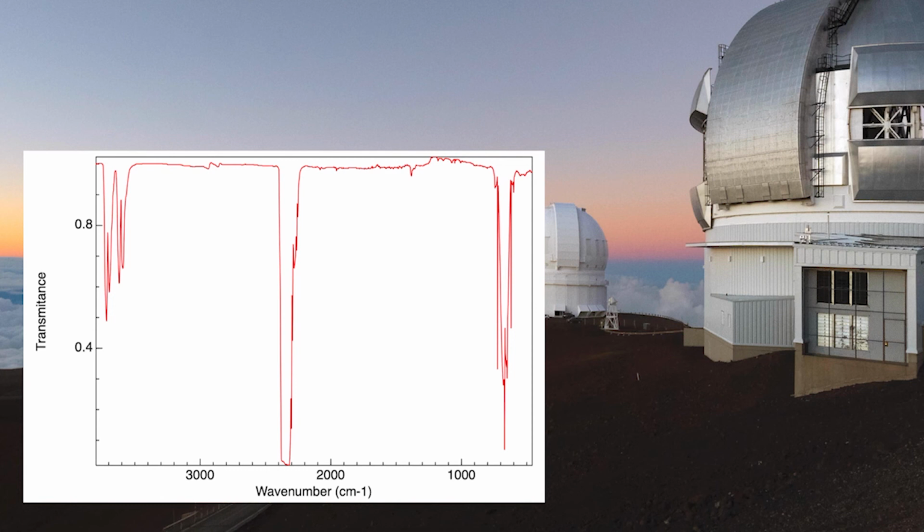And we can see from the infrared spectrum for carbon dioxide, that equates to the bending of carbon dioxide, and this particular peak for the asymmetric stretch. Now, there's no symmetrical stretch for CO2. Why would that be?